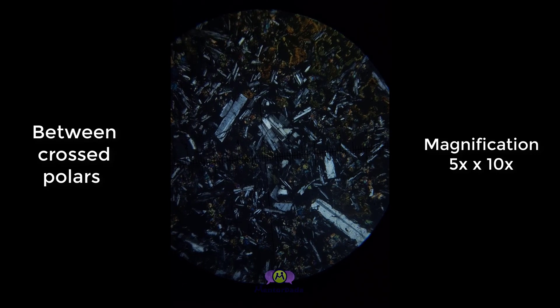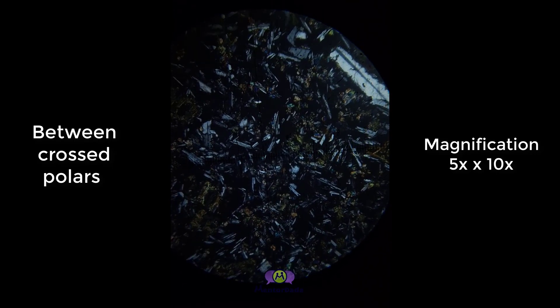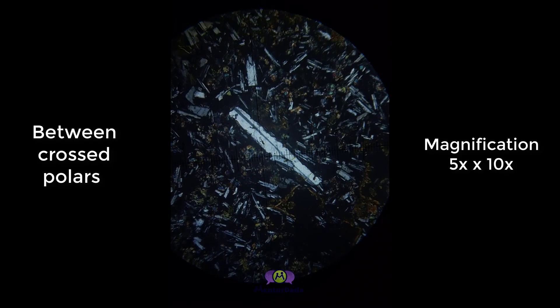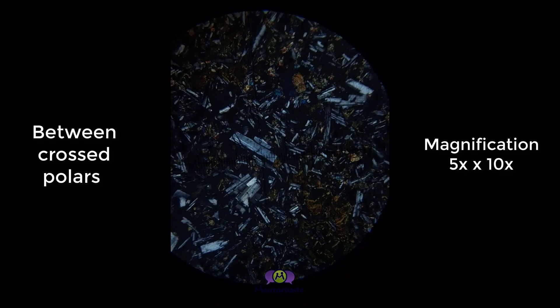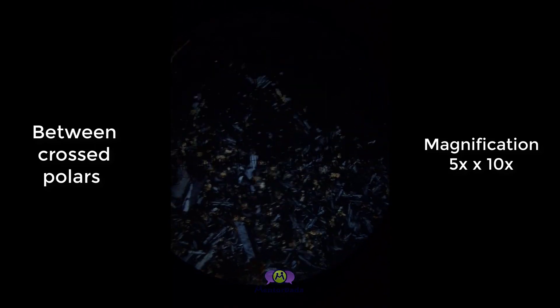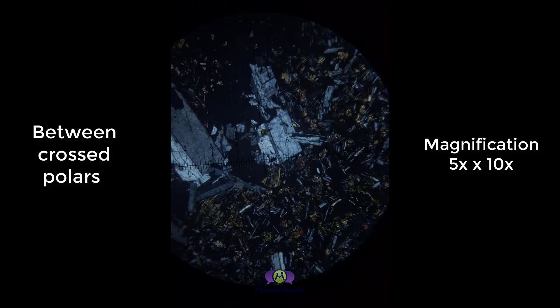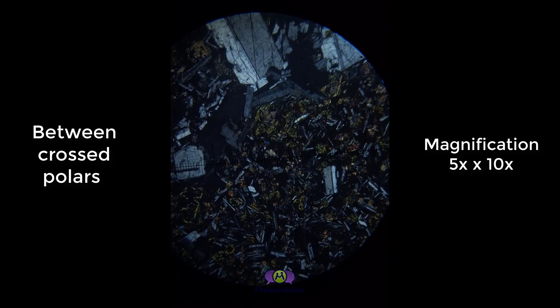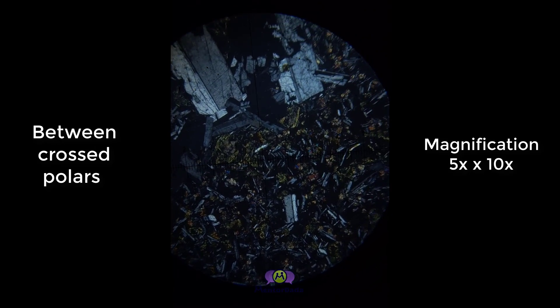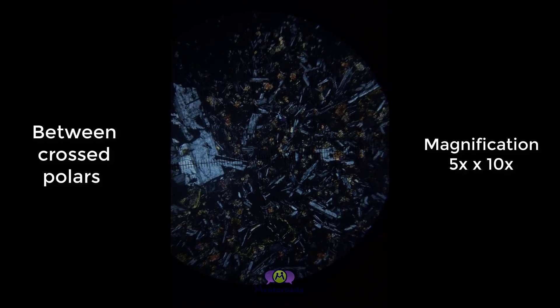Under XPL, you will observe that the plagioclase laths are showing lamellar twinning. Some of the plagioclase are coarse grain and some are fine grain. The yellow patches are mostly devitrified glassy materials and some of them are pyroxenes.